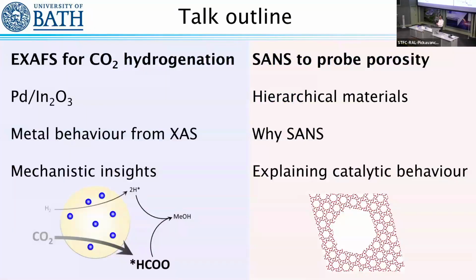In particular, I'm going to talk about two different case studies. One is an EXAFS study, which I did during my time here with Andy Beale, looking at palladium on indium, and we're going to be talking about CO2 utilization. And the other study is going to be using small angle neutron scattering on hierarchical materials to try and explain some catalytic behavior.